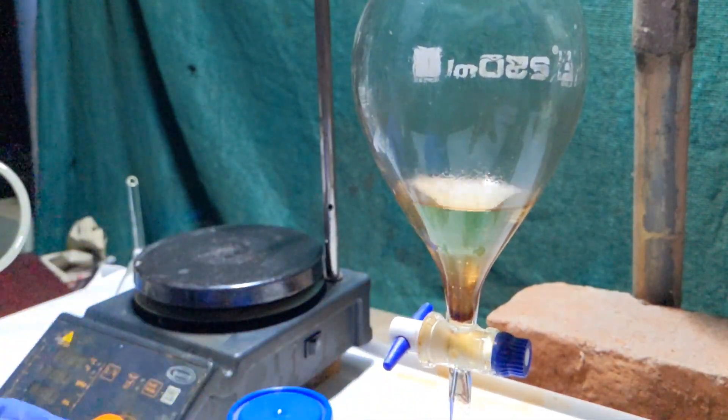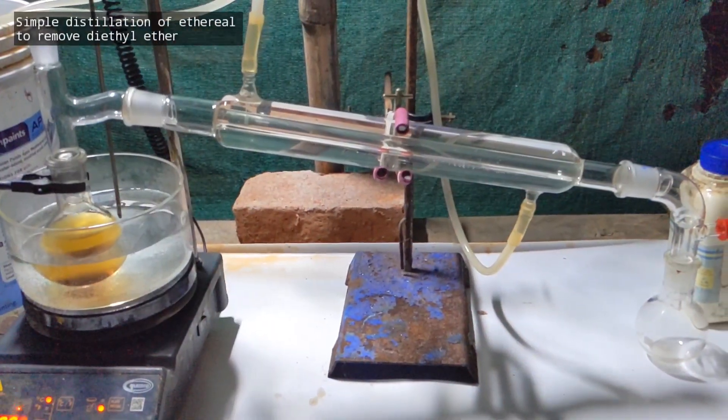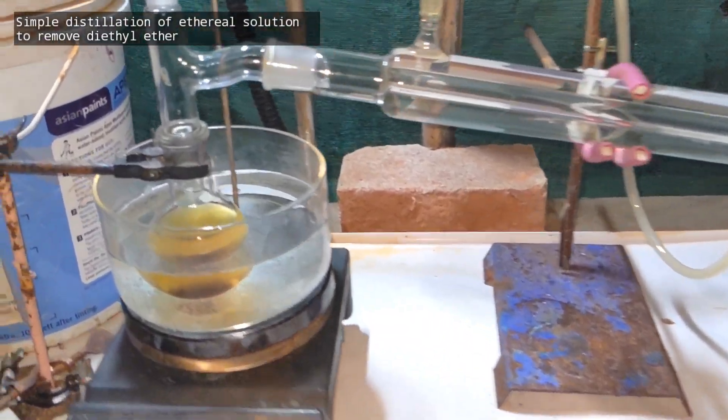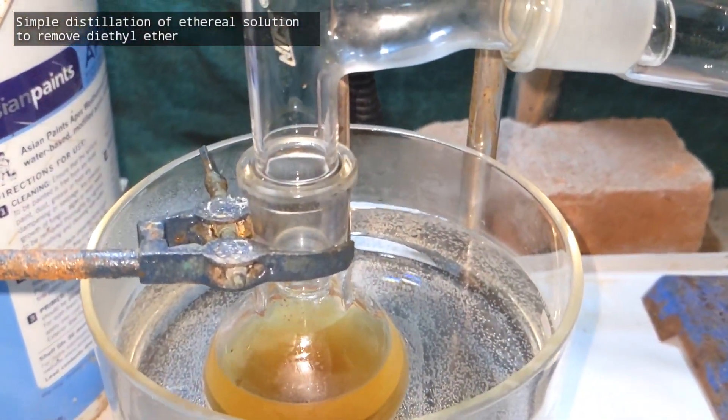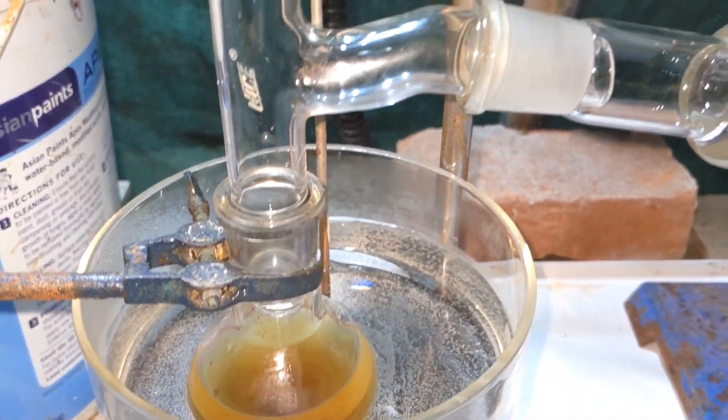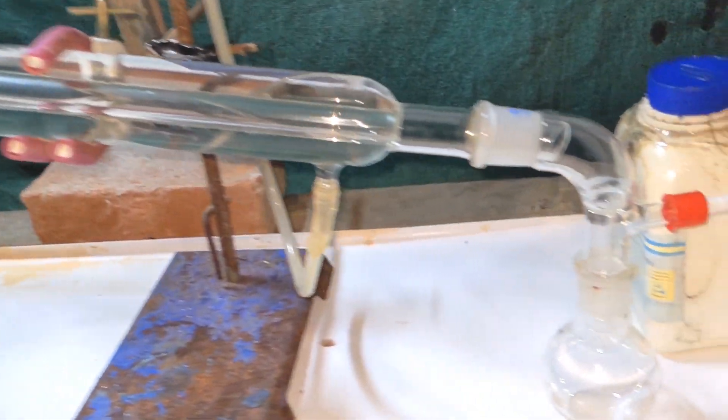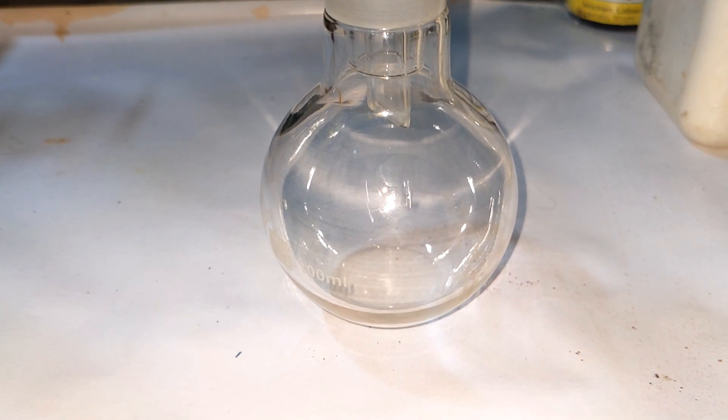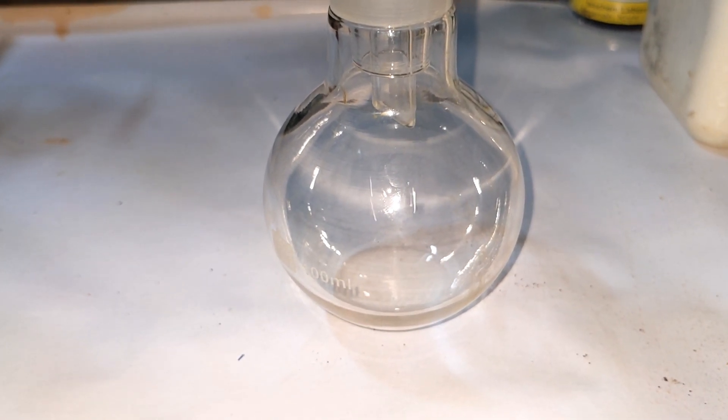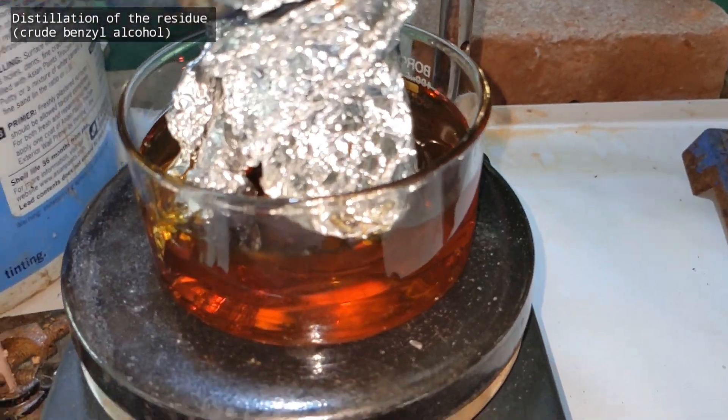After 5 cycles of extraction using ether, the ethereal part was taken in a round bottom flask and all the ether was removed using distillation. This way you can recycle the solvent diethyl ether. It has a very low boiling point and for uniform application of that low heat, I used a hot water bath.